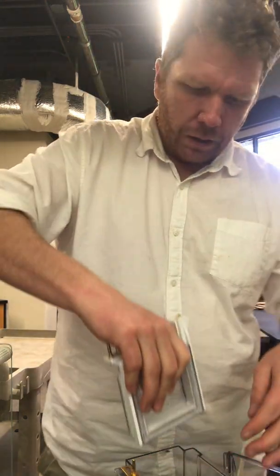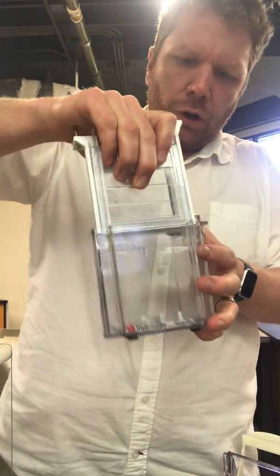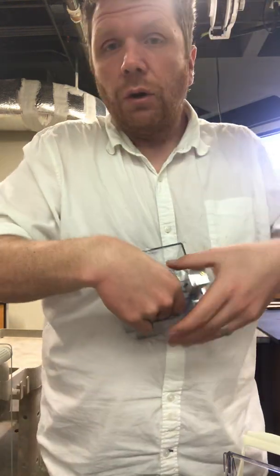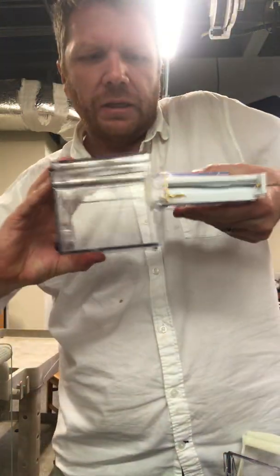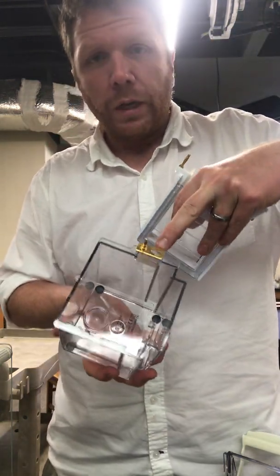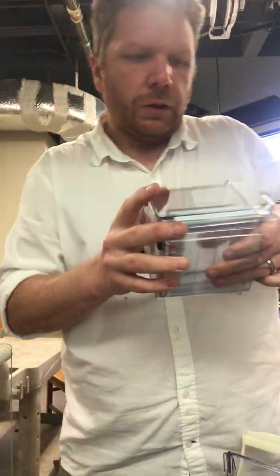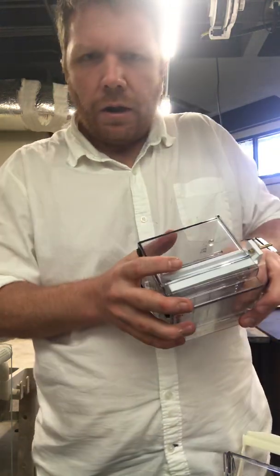Now I'm going to carefully put this back into my gel box. The great thing about these gel boxes is it's only going to fit in one way. You can't put this in backwards because it has these plastic grooves here and this hole right here that this will fit in. So I've assembled my apparatus, and boom, this is ready to go.